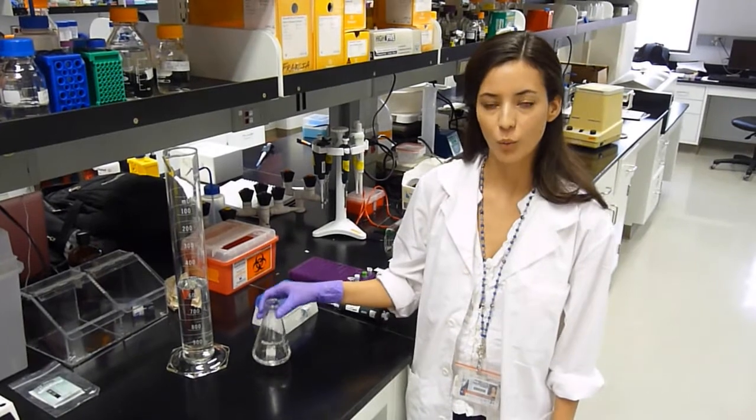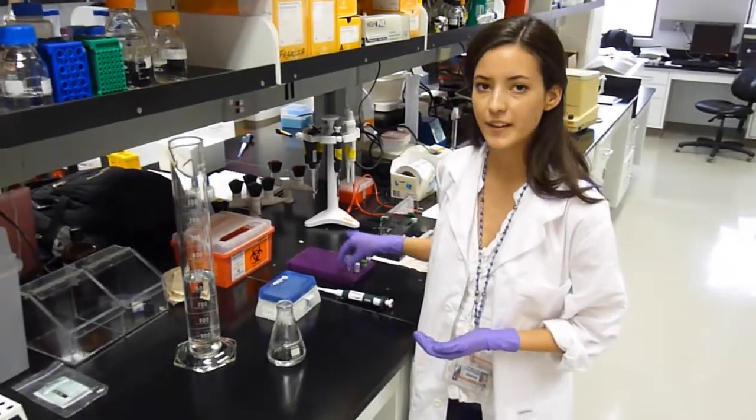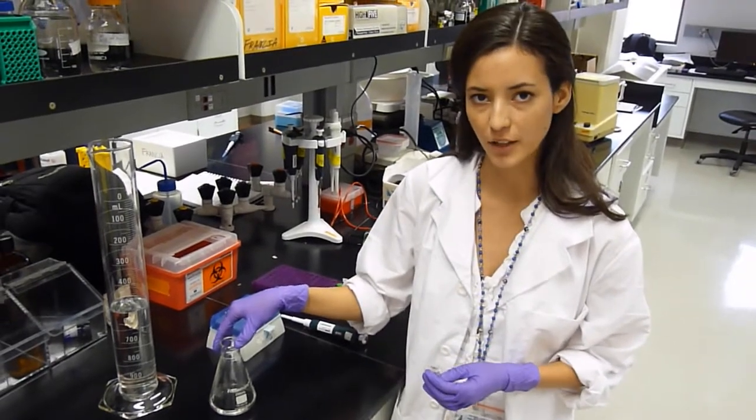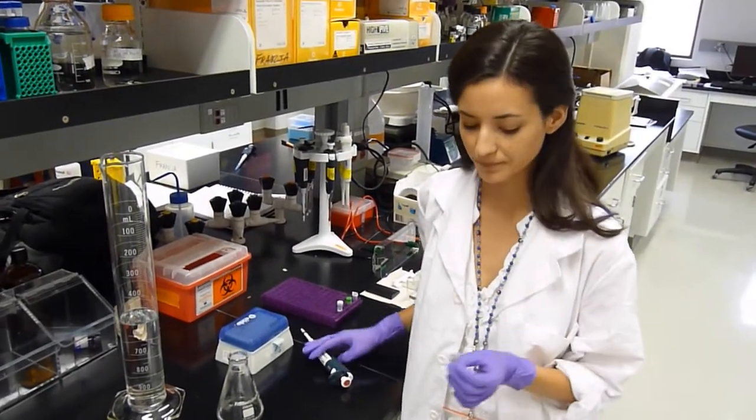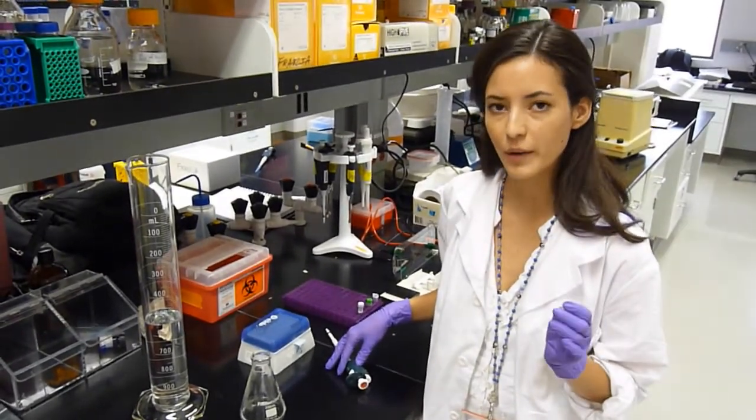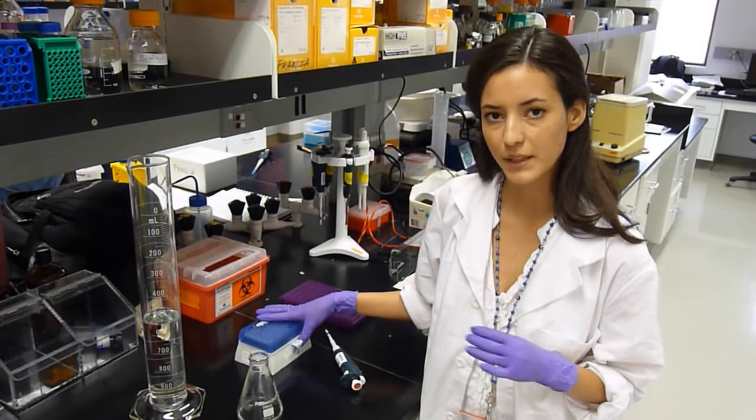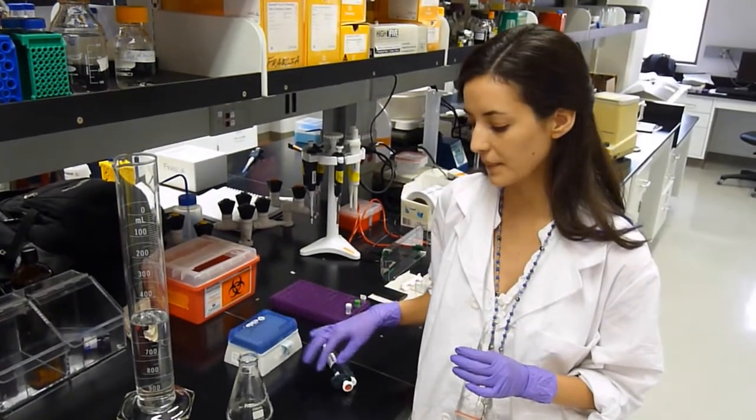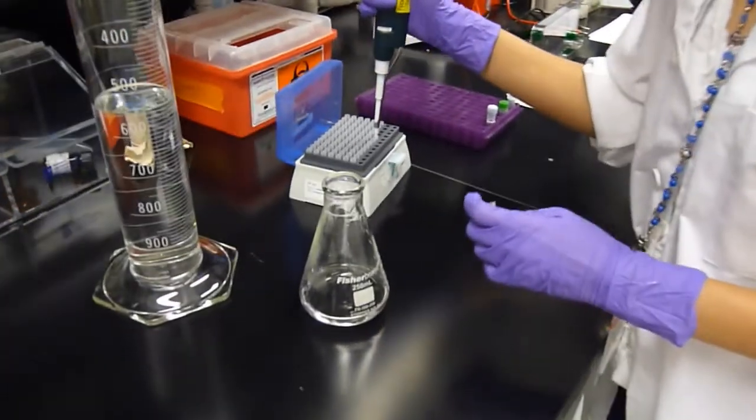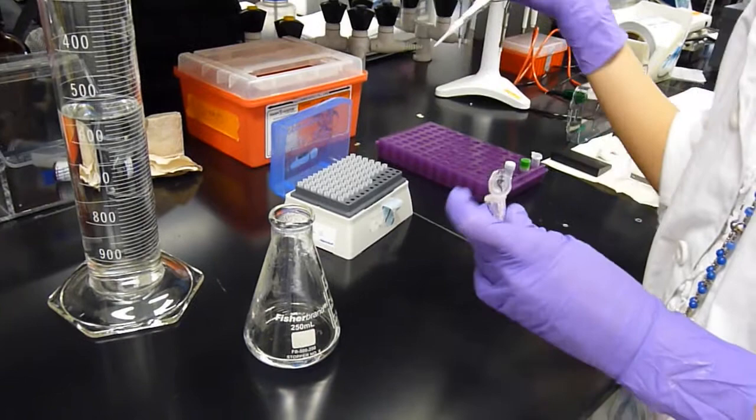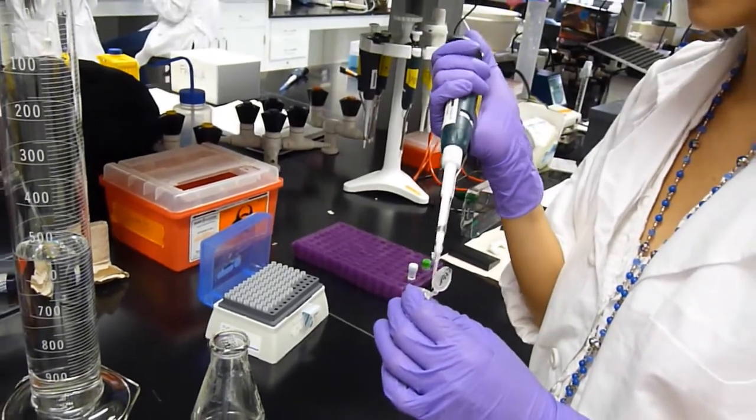After you have melted your agarose, wait for it to cool to 60 degrees Celsius or until it's warm to the touch. Now, we're going to add ethidium bromide into our agarose solution to be able to visualize the DNA in our gel. You have to be careful with ethidium bromide because it is highly mutagenic, so when handling this compound, always wear gloves. For this, we're not going to need any more than 5 microliters, and right now I'm just going to add 4. A helpful tip that I learned is that ethidium bromide will load itself into the agarose solution. All you have to do is place your loaded tip into the solution and wait for it to dispense.